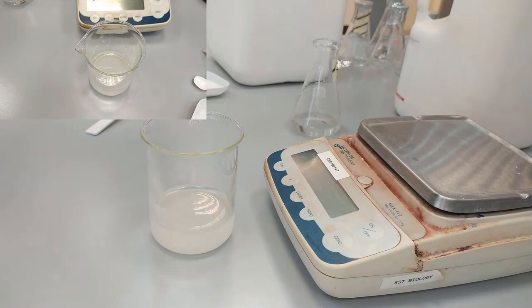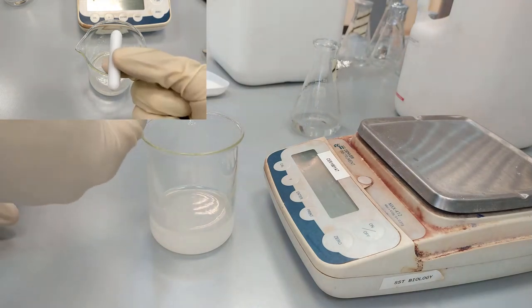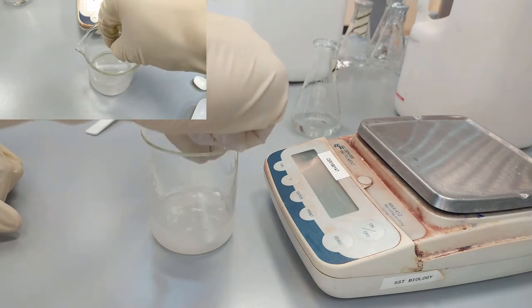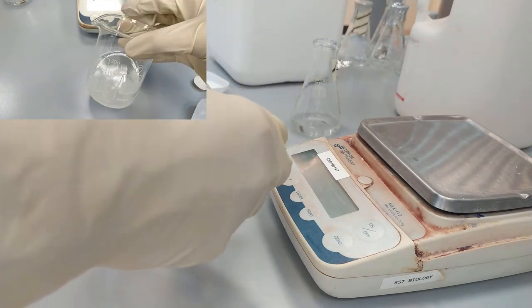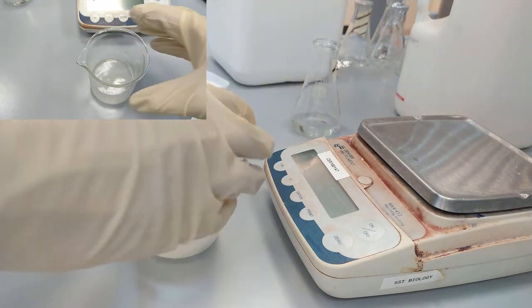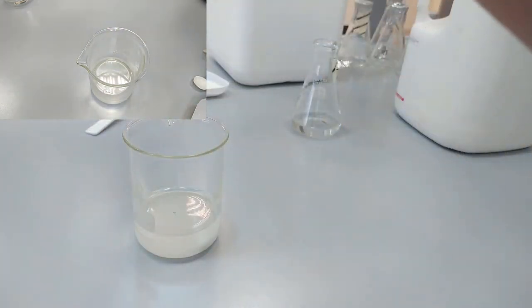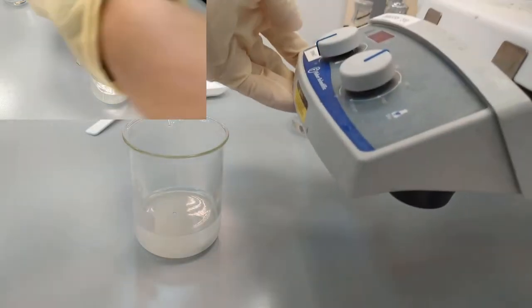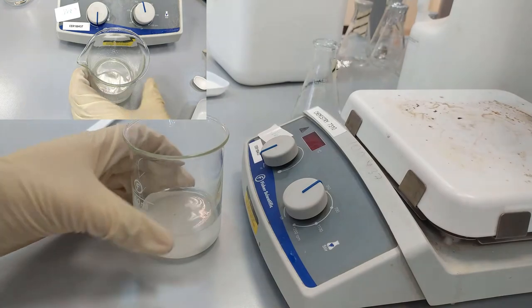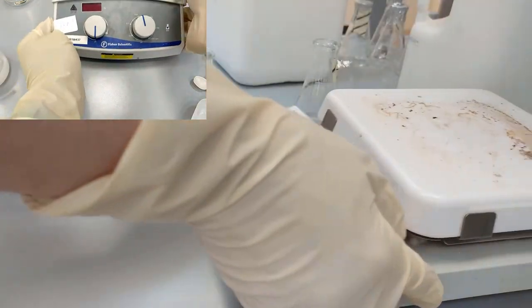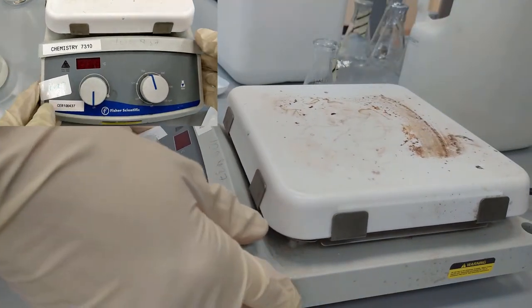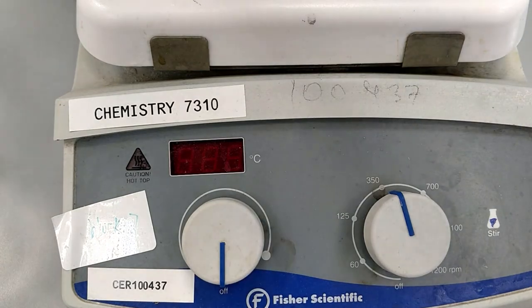We are going to mix it with a magnetic stirrer using the magnetic beam. So you put the magnetic beam in the solution. Of course, it has to be clean. Then you take the magnetic stirrer.